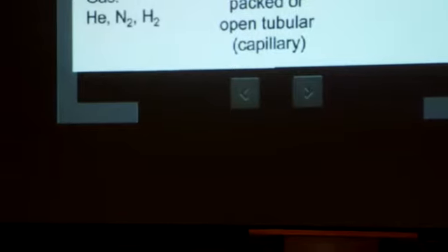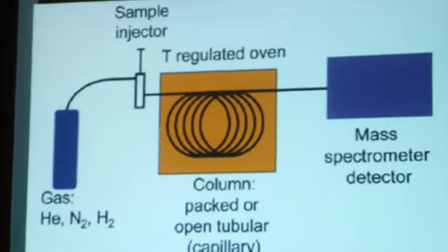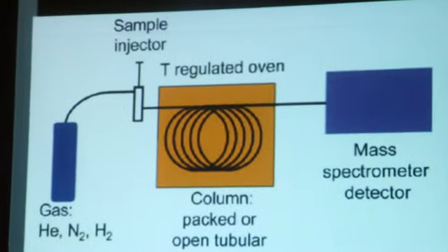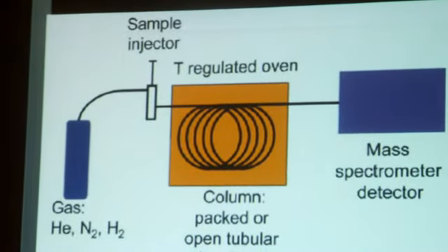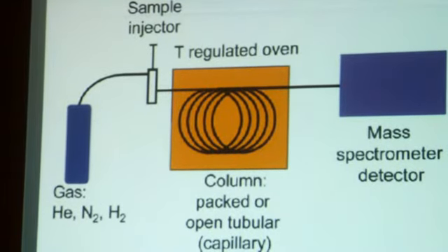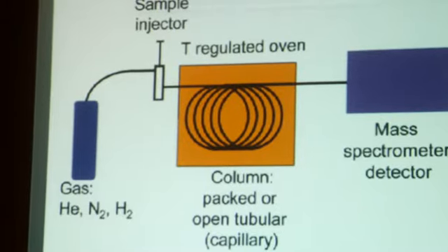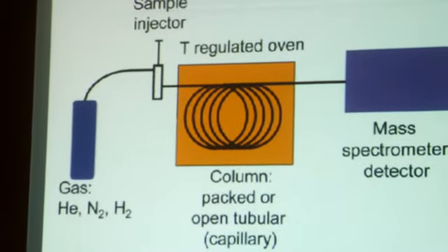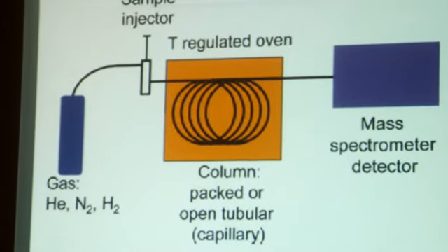The molecules stay in the column and then elute at different times. So different molecules enter the mass spectrometer at different times. There's the mass spectrometer. And the mass spectrometer captures, ionizes, accelerates, deflects, and detects the ionized molecules separately by breaking each molecule into ionized fragments and deflecting these fragments using their mass charge ratios.